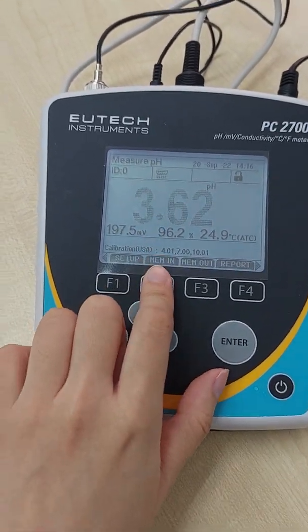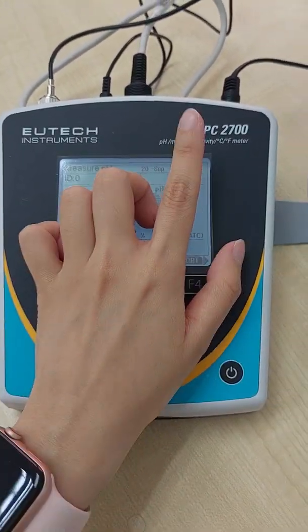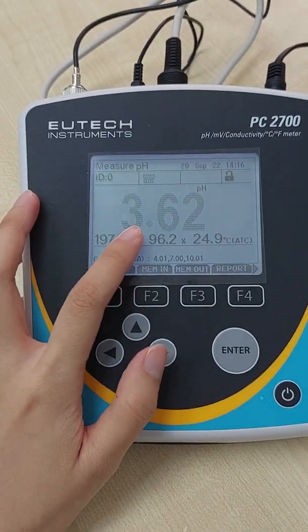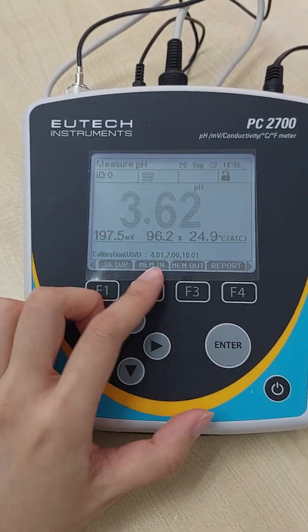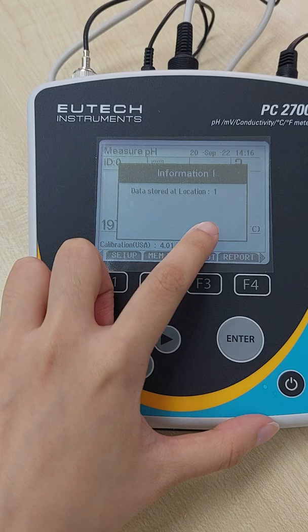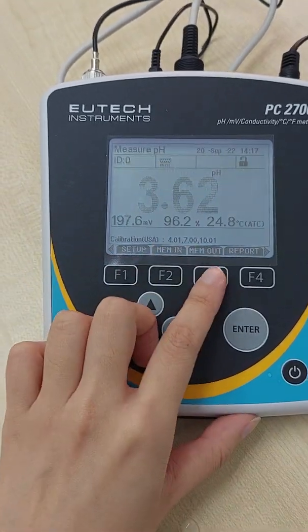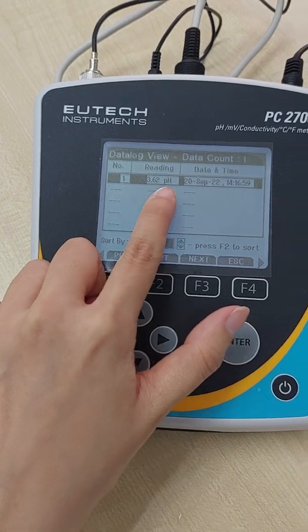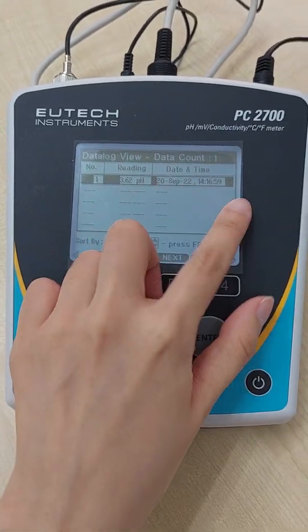Next, we have the memory in and memory out. So for PC2700, you can store up to 500 data. So if you want to save a data, just press memory in. Then it is stored. Location. Then you go memory out. You can see the reading is stored right here, the date and time.